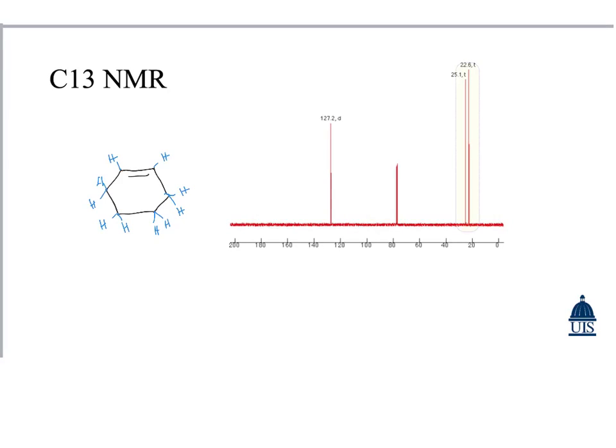When looking at the carbon 13 image, we identified 3 carbon environments, 1, 2, and 3. The first thing we're going to do is split our structure around here, followed by another split around here, giving us 1, 2, and 3 carbons.